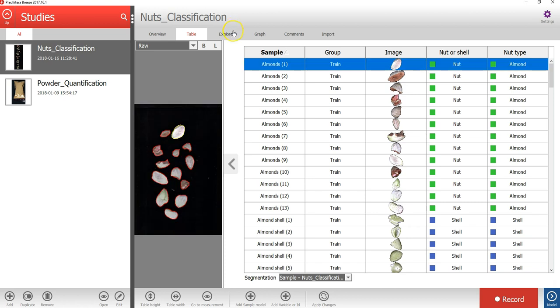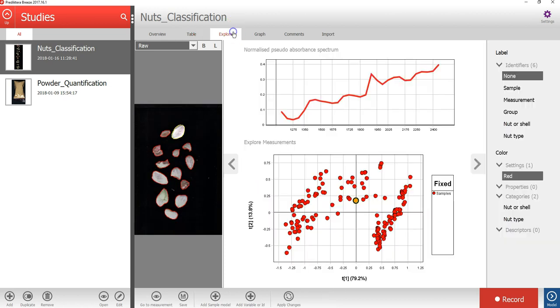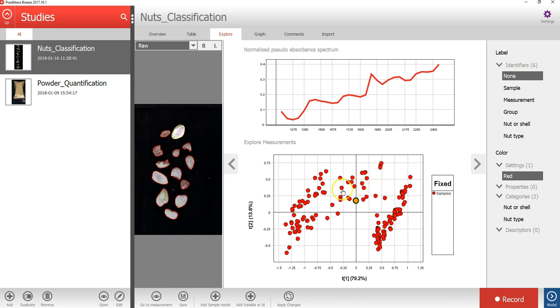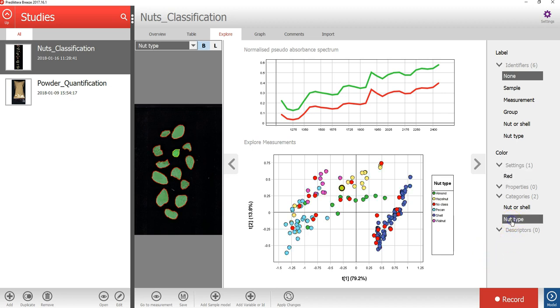If I press the explore tab, I can see a PCA based on the average spectrum for each object. Under color, I can then select nut type to see how the different types cluster. And we can see that all the different nut types are on the left, and that the shell are clustered on the right.